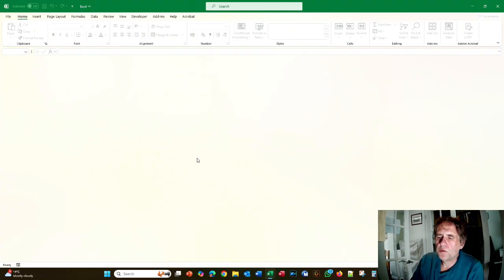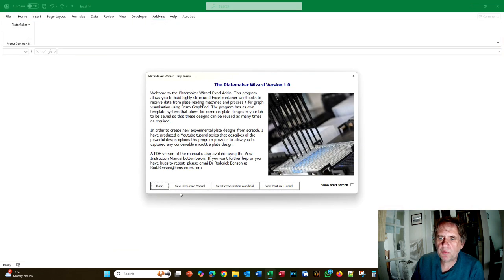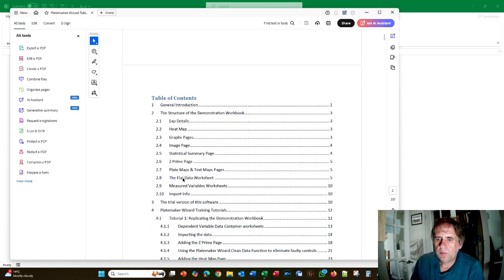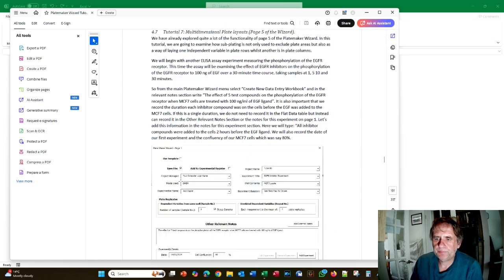Hello and welcome to tutorial 7 of the platemaker wizard. So once again we go to add-ins, we go down to help, demonstration workbook, view instruction manual, we go down to table of contents and we select tutorial 7.